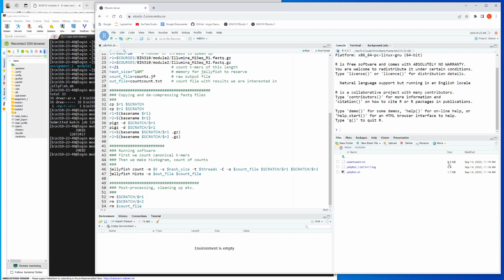It's not super big. It's a good idea to look if the file is big, because if you try to open very big files in RStudio, it will sort of hang, or it will take half an hour to open it, right? So please don't click on big files, because then you will block your RStudio for a long, long time.